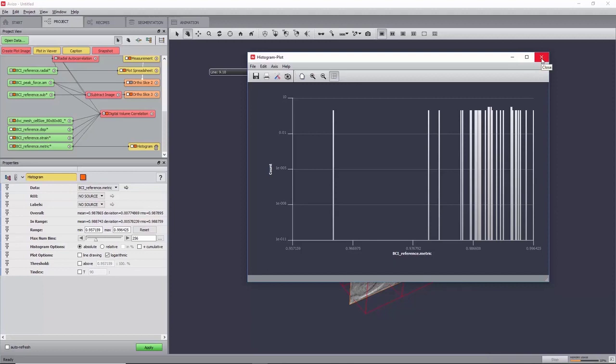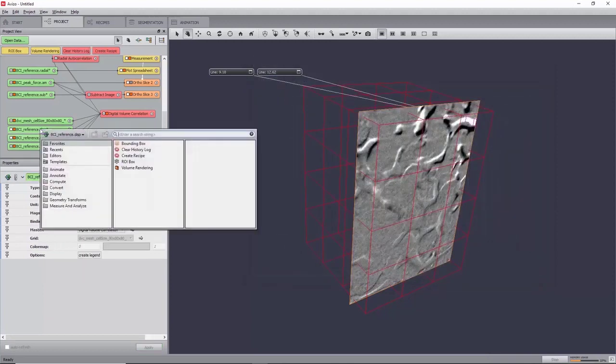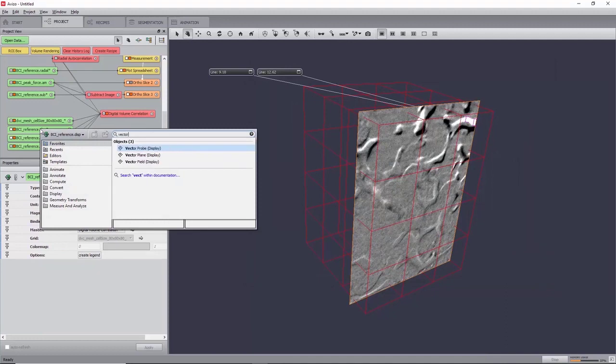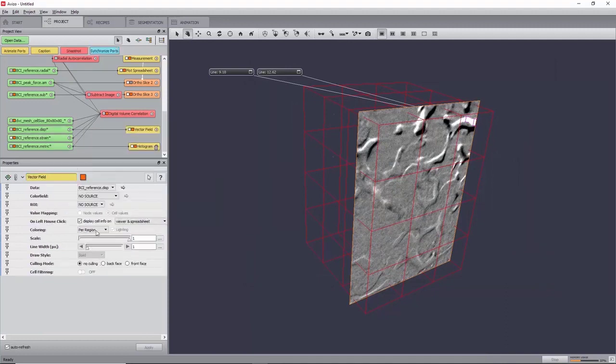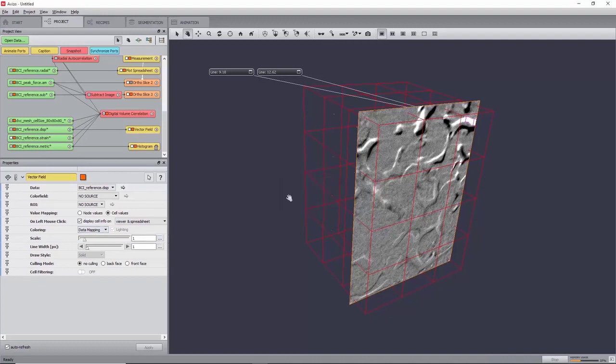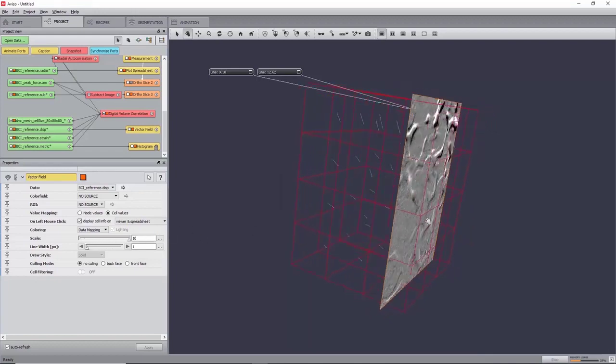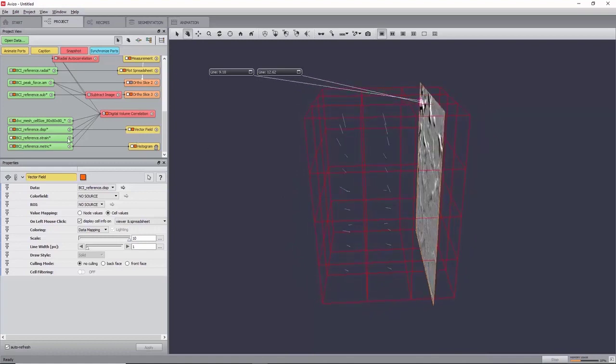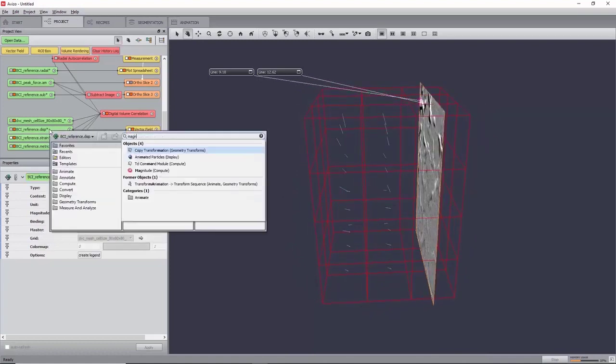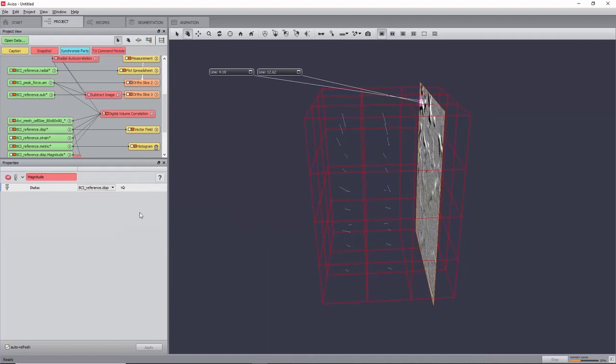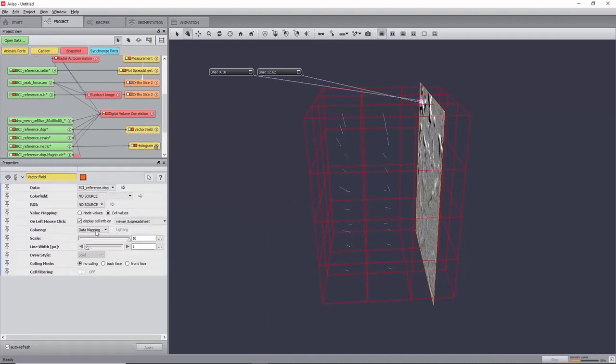The displacement field can be viewed by creating a vector field module, setting the colouring to data mapping, and increasing the scale by clicking on the three dots to first increase the maximum value to 10, and you can now slide the scale up to 10. Additionally, the magnitude of the displacement field can be computed using the module magnitude, and the resulting data field can be selected in the colour field port of the vector field, and its colour map set to physics.